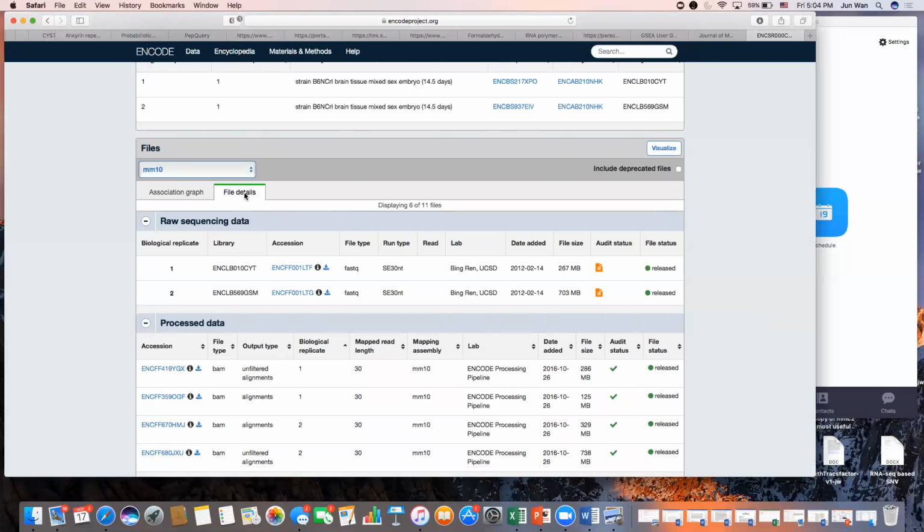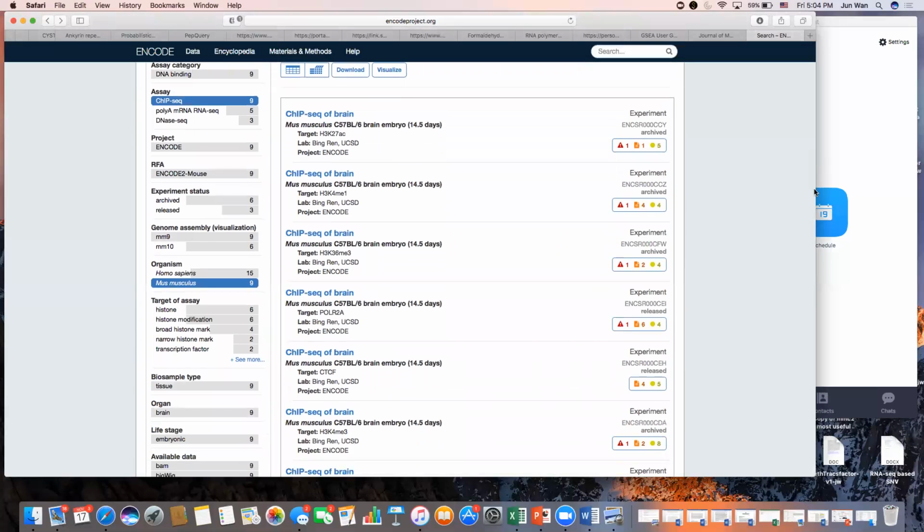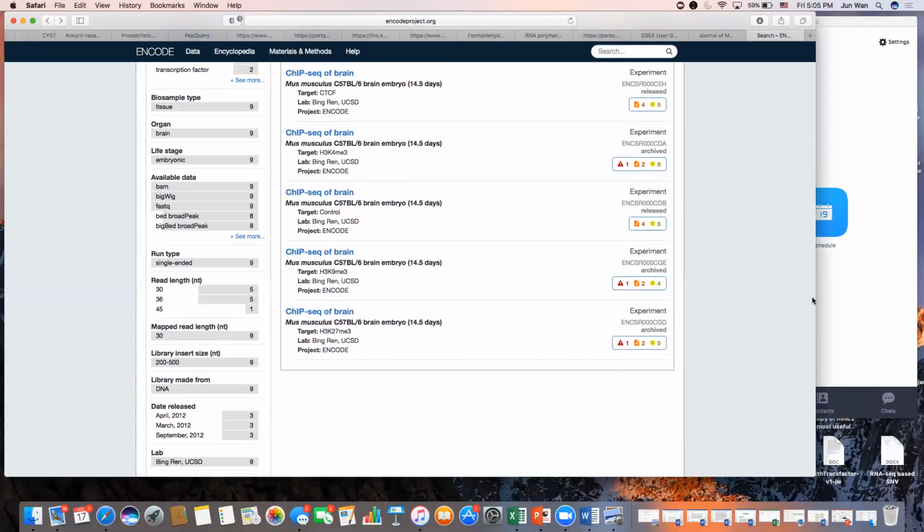Right-click on this tab right here. And what that's going to do, it'll give you the opportunity to copy the address. So when you're in Karst, you can put wget, put in your address, and download the file. Okay, do that for 2 FASTQ files for CTCF, and then we're going to do the same thing for control. And I want you to see everything here is extremely straightforward. There should be absolutely little to no confusion. It's called control. So we'll do the same thing again.